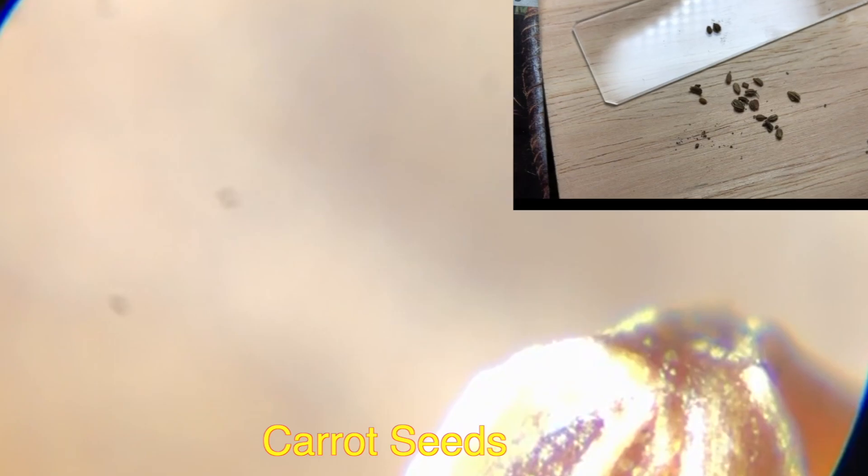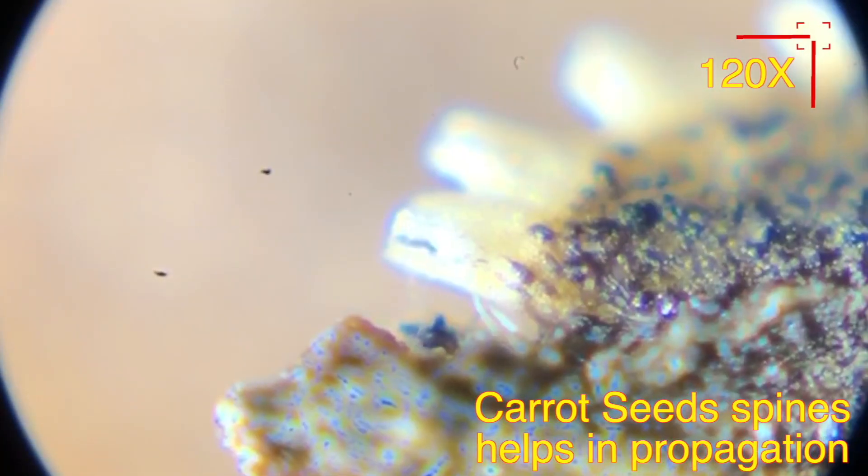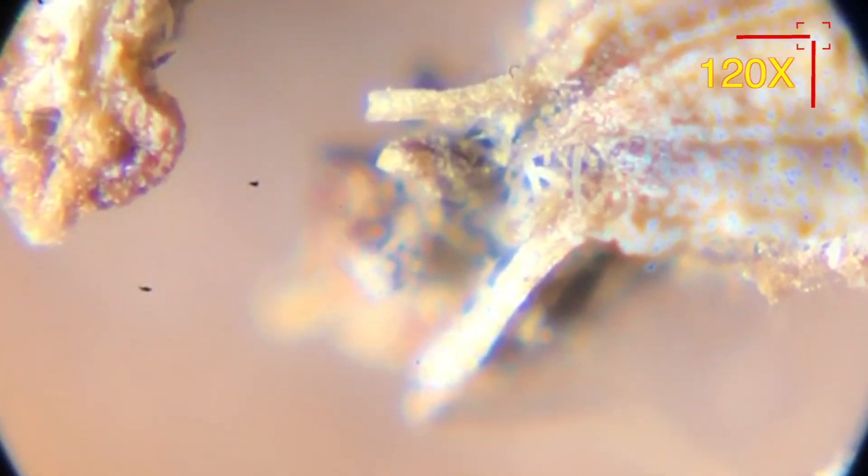Let's look at carrot seeds. The carrot seeds are pretty interesting — they look like an insect with legs and a tail. Those leg-like structures help these seeds in propagation.